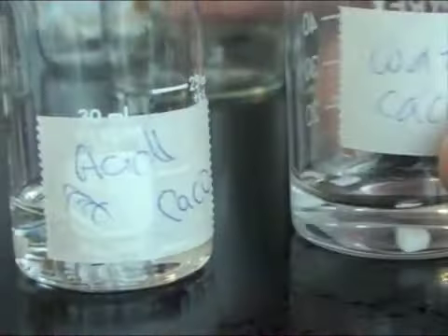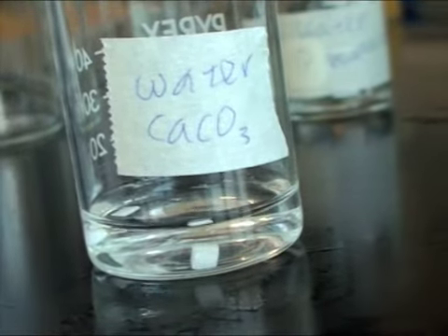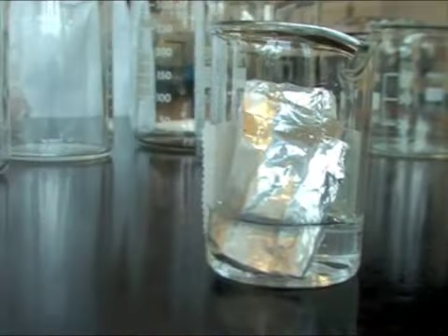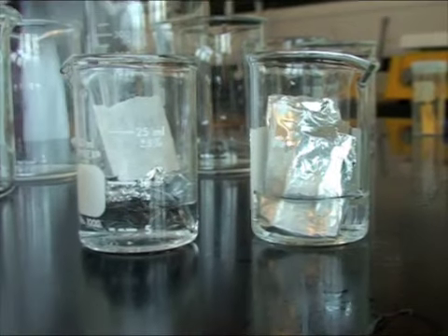For the limestone, unfortunately there weren't too many observations that we could make without massing the limestone. However, the acid limestone did seem a tiny bit smaller. For the aluminium, we could observe nothing particularly in the beakers. However, later when we took them out, we observed more. Right now they both look the same.